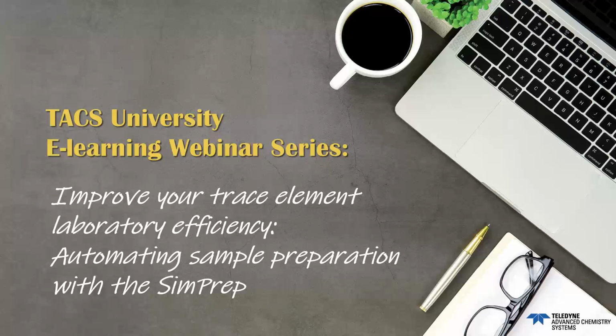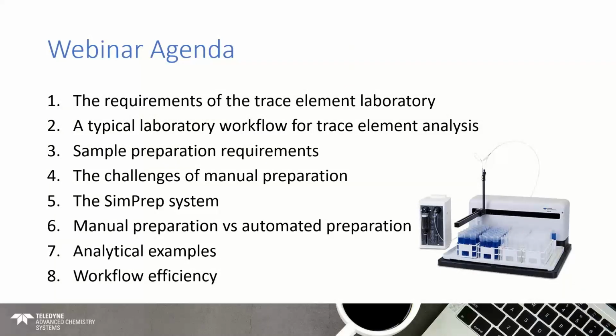Hello, everybody. Thank you for the kind introduction, and thank you, everybody, for attending today. My name is Pete Winship. I am the EMEA Sales Manager for Teledyne CETAC Technologies. I am an analytical chemist by training, so my background is in this area. Today we're going to be discussing trace element analysis and laboratory efficiency, and we're going to be looking at automating sample preparation.